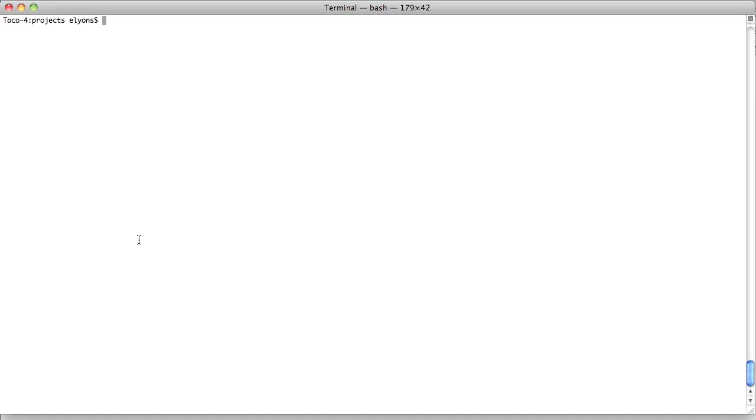Hi, this is Eric Lyons, and this is a quick video tutorial on how to use the iPlant Datastore to get data into CoGe. I'm going to show a little bit of this from the command line as well as a little bit from the web interface for the iPlant Datastore.